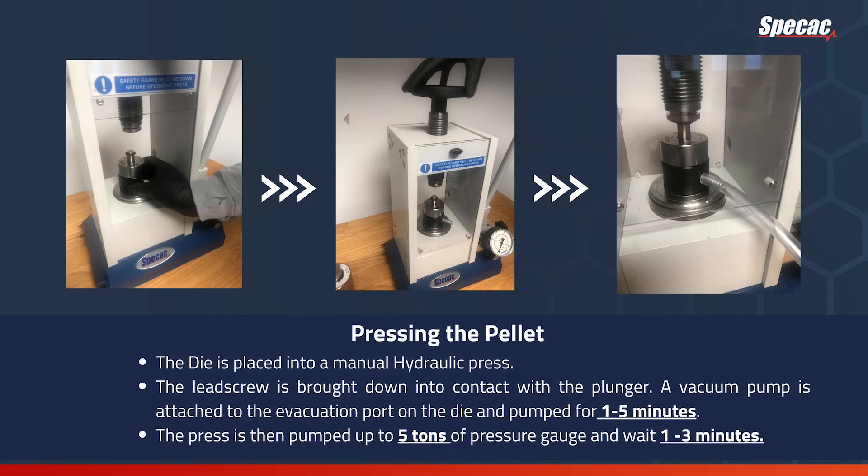To press the pellet, the die is placed into a manual hydraulic press. The lead screw is brought down into contact with the plunger. A vacuum pump is attached to the evacuation port on the die and pumped for 1 to 5 minutes. The press is then pumped up to 5 tons of pressure and held for 1 to 3 minutes.